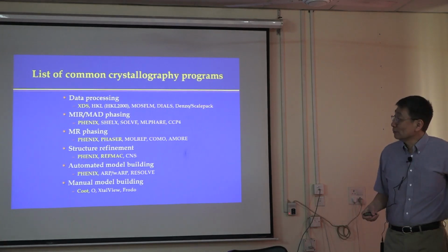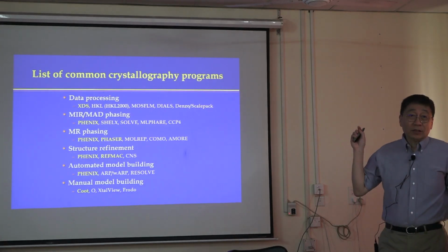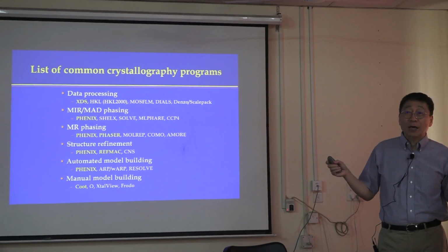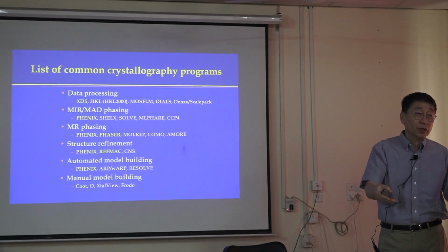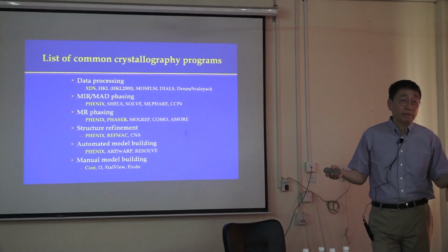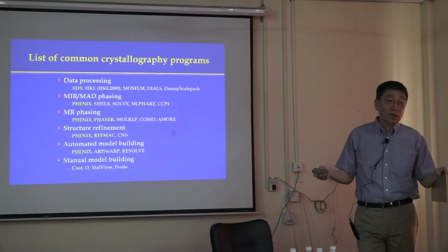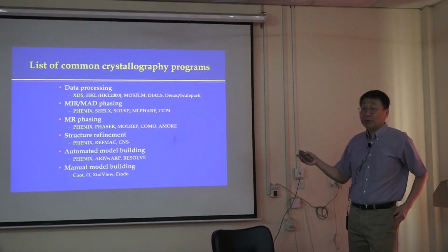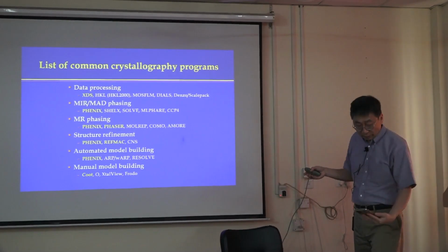So as your dean said, take advantage of it. Okay, so the next part for crystallography is mostly application, as a user of crystal structures or structures in general: what tools are available. Some of this you may be familiar with, like PDB, you're all familiar with, which is good. And then maybe others as well.